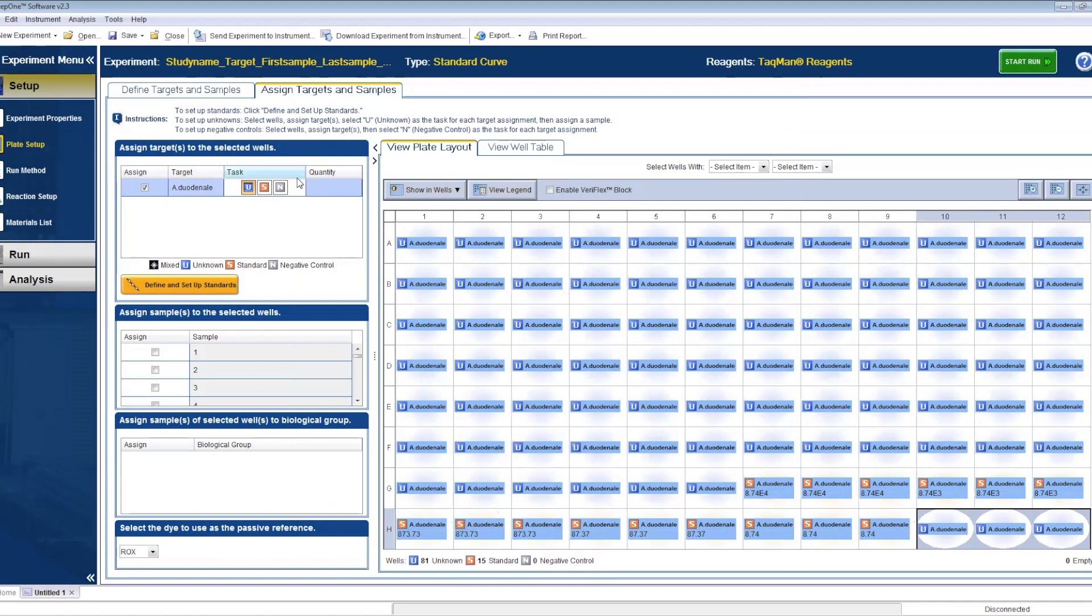Highlight the last three wells and mark them as NTC from the taskbar. Now you have to assign the sample names for every two replicates or wells.